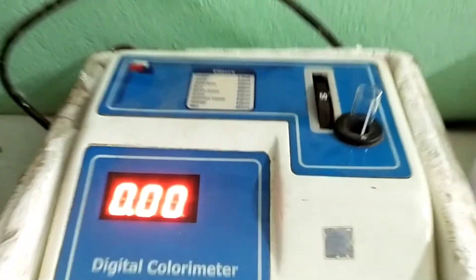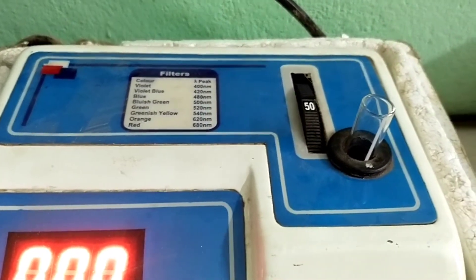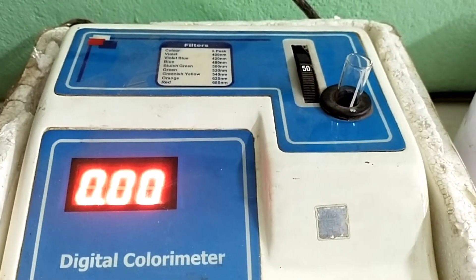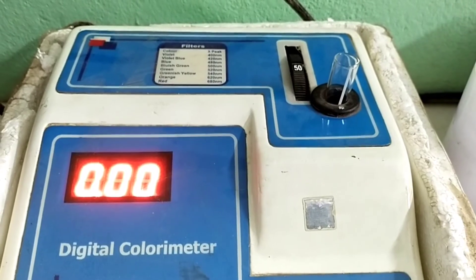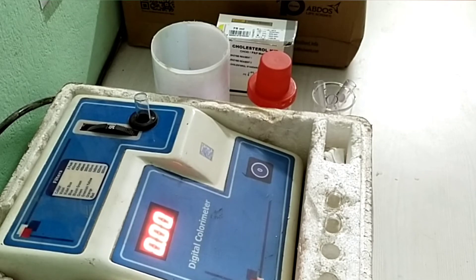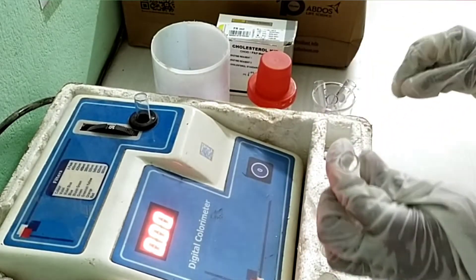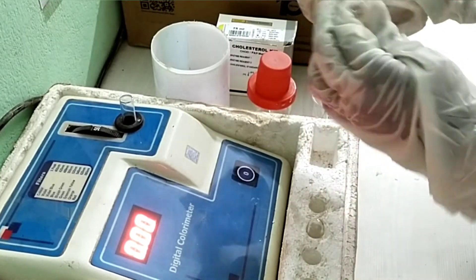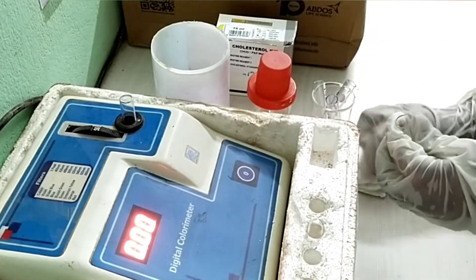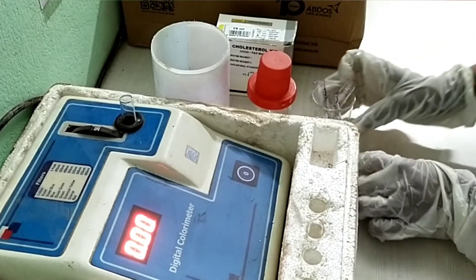Set the colorimeter with plain distilled water for zero setting using filter number 50, which is 505 wavelength. Let's start the procedure to take readings for blank, standard, and sample or test. Clean the tube very well and wipe the outer portion with tissue paper.